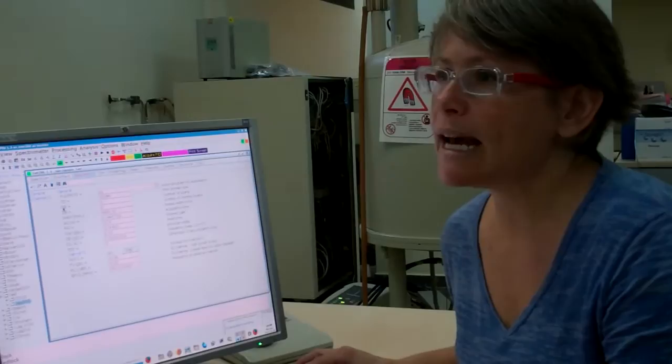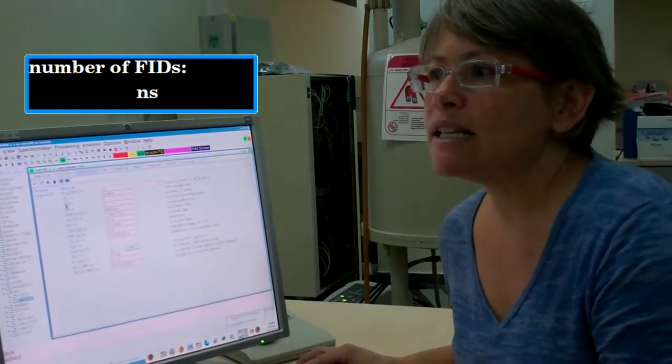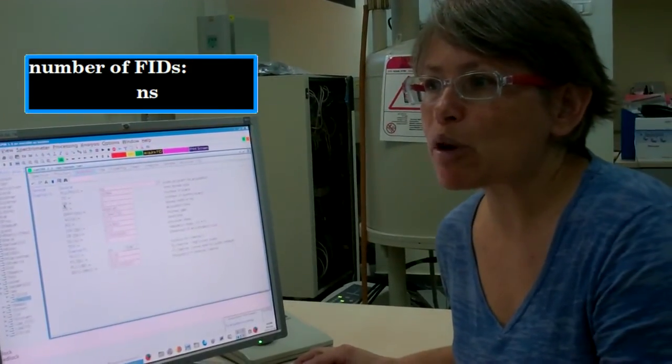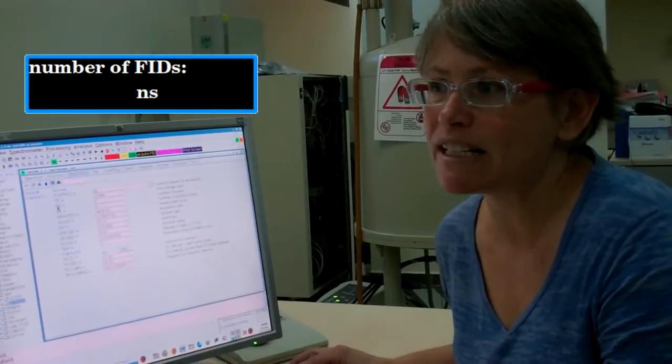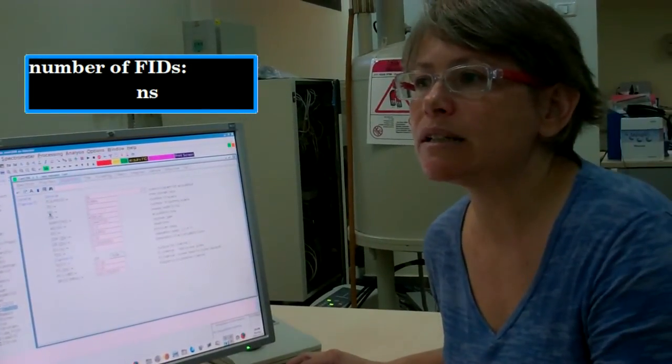The next parameter is NS. This determines how many times the Pulse Acquire experiment will loop, or in other words, how many FIDs will be signal averaged to increase the signal-to-noise ratio.